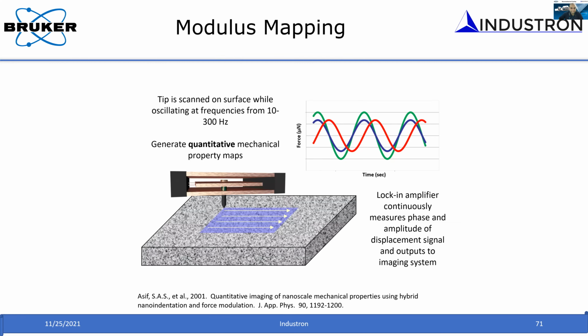You have to apply a very small load so that you are on the thin film rather than on the substrate. That's the only condition I can think of. Otherwise, if the material allows you to load and you have the capability to apply the load, you just go ahead.